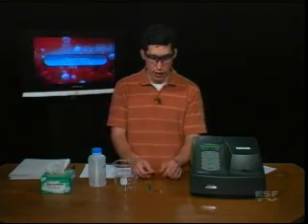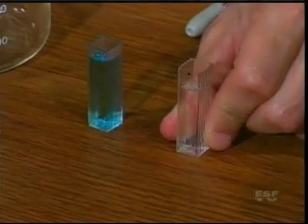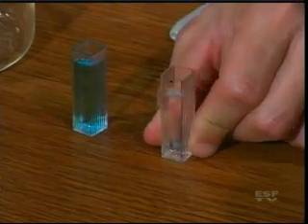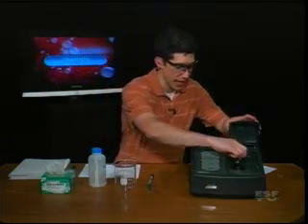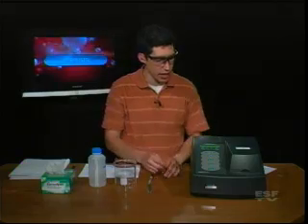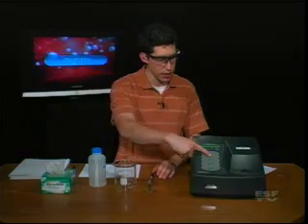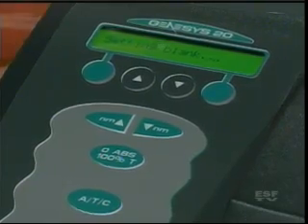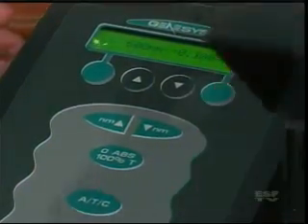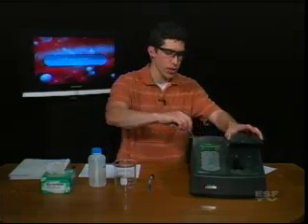Before I do that, I'm going to need to know which way my cuvette is pointed so I can stay consistent. On this cuvette, I've already placed a small black mark, and by putting that black mark there, I know it's always going to face out. So I'm going to put my cuvette into the spectrometer facing out, close the cover so we don't have any stray light get in, and then hit the zero absorbance button — that should set our absorbance to zero. So we've set it to zero and blanked our solution, so now the only absorbance we read is going to be the absorbance of the blue solution.